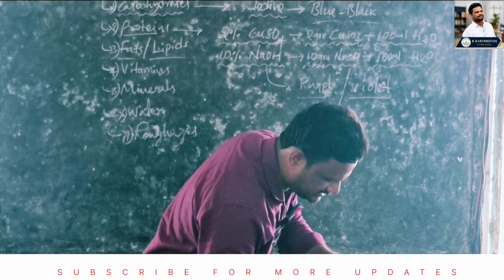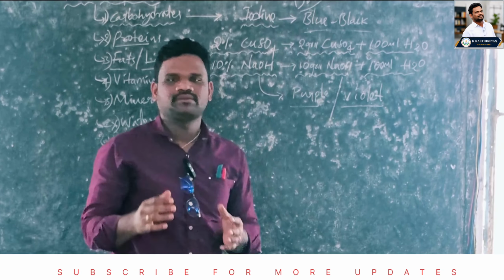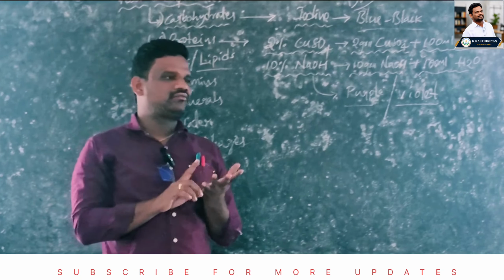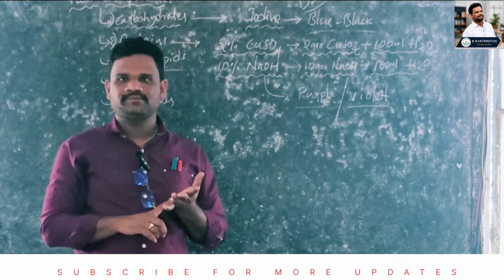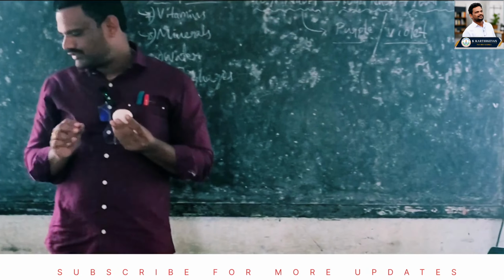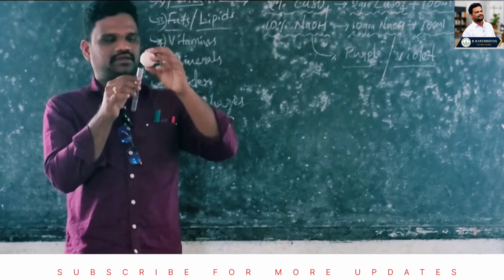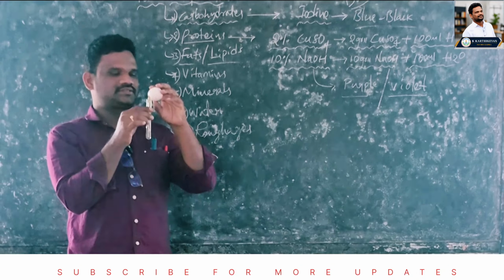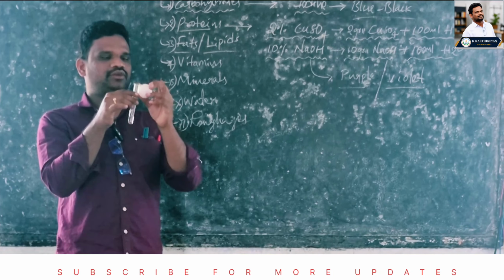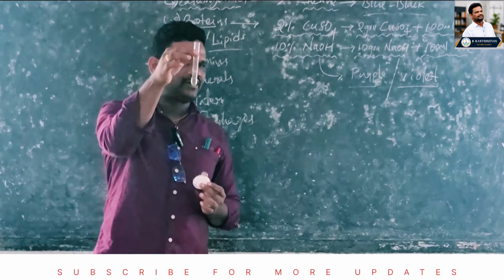Okay. Let us do the protein test. For the protein test, we need a sample. Sample means the food material which contains proteins. Already we know egg white contains proteins, right? So we have egg white here. For this experiment, we need a test tube. Into the test tube, we have to add egg white. Why egg white? Because it contains proteins. We are going to confirm whether proteins are there or not in the food material. This is the sample of a protein.